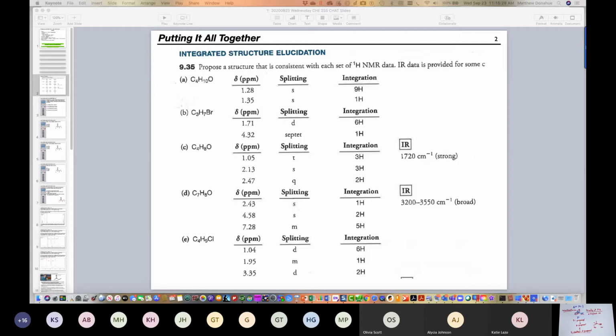So Katie's asking about nomenclature. For this example, yes, you count the longest carbon chain, and it just so happens that the OH group is sticking off that chain. There are certain functional groups like aldehydes and carboxylic acids where the highest oxidation carbon has to be at the terminal part of the chain, so it's sort of included.